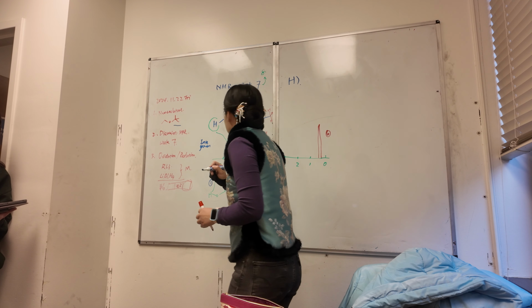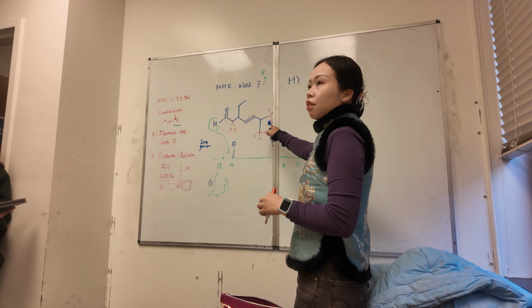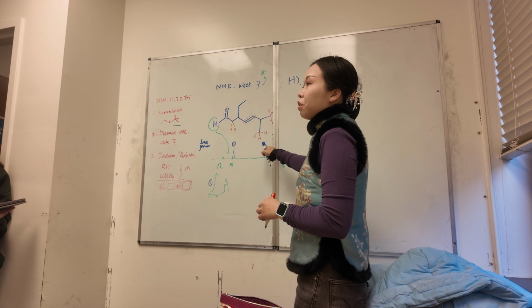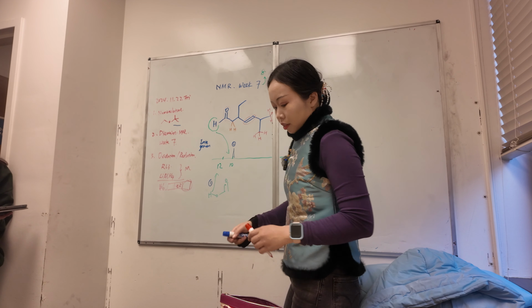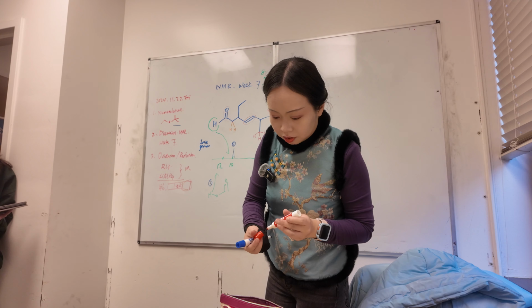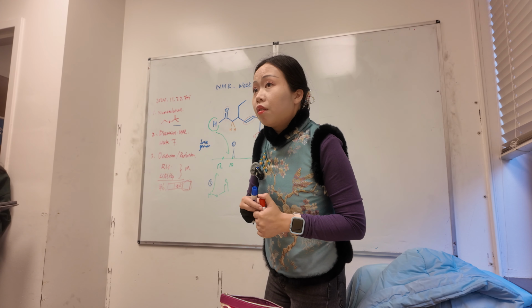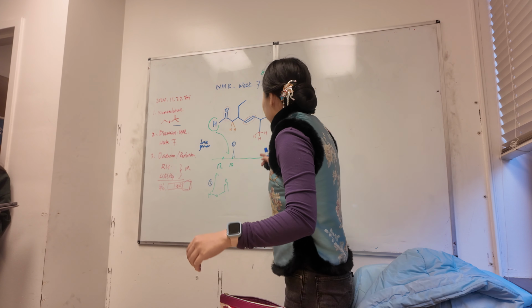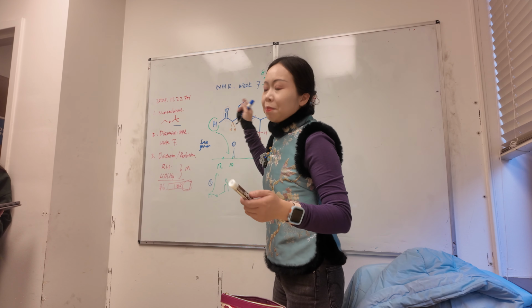Okay. Yeah. That's the red one, right? That's the red one. Are people good with this one? Shouldn't the one with 6 have 2 peaks on it? Yes, we haven't got its integration, but we will do the splitting in the next step.